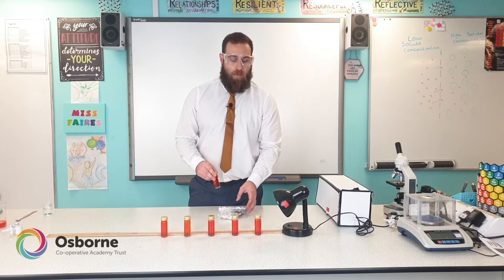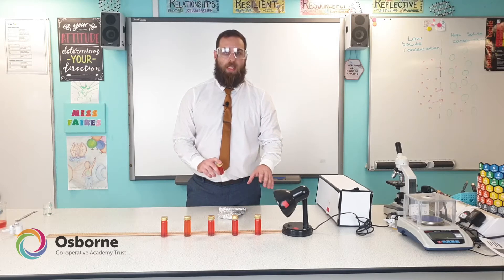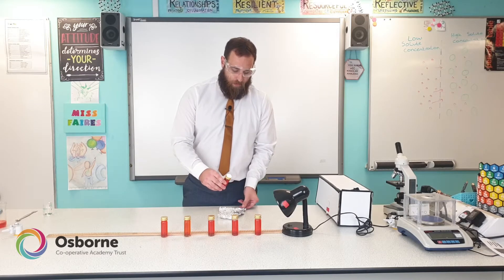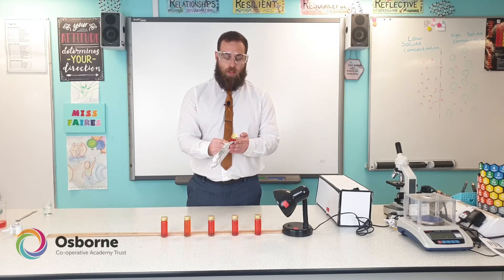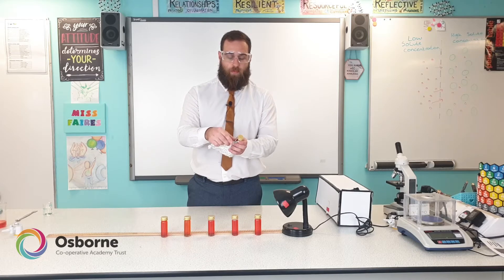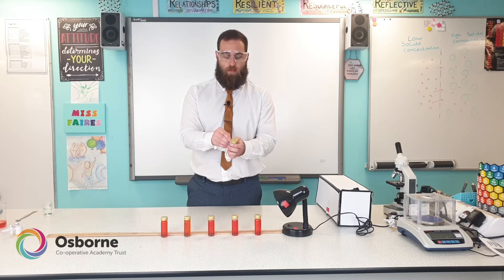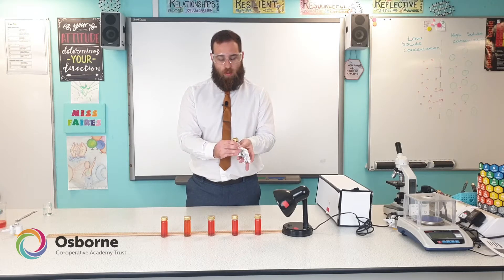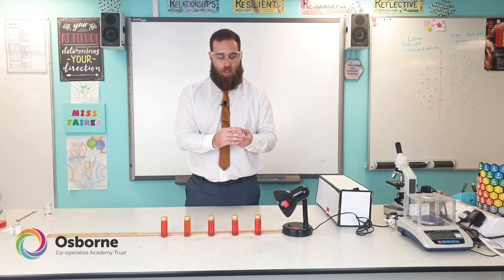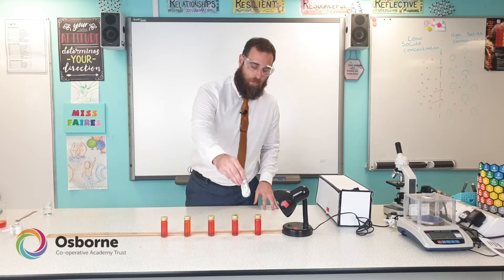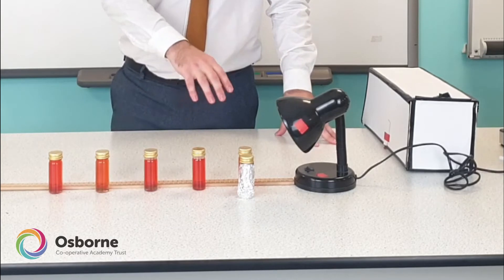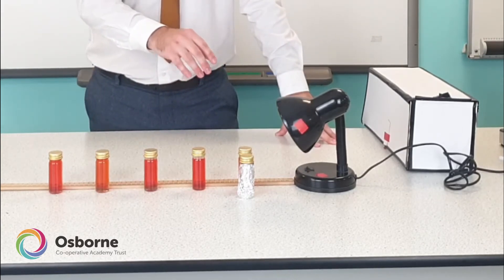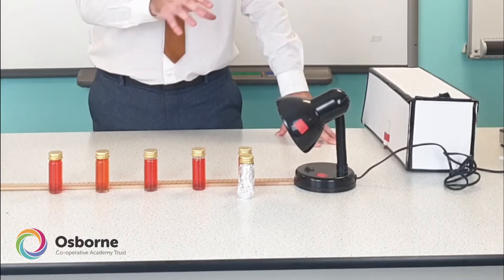Because we're testing for light intensity we need a control to ensure that the variable we're testing is actually what's causing the effect. We get a Bijou bottle with 20 algal balls in the indicator solution, but this time we wrap it in tin foil. We place it in line with the first Bijou bottle — the tin foil stops any light from getting in, so we can confirm that any changes are only happening because of light intensity.